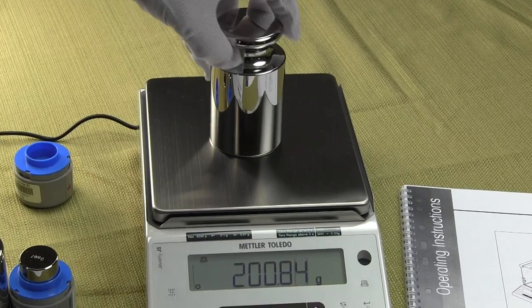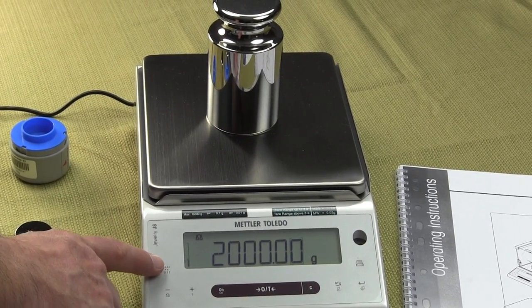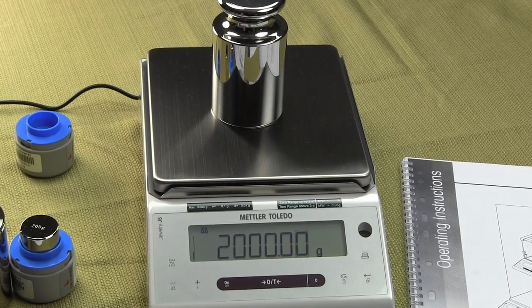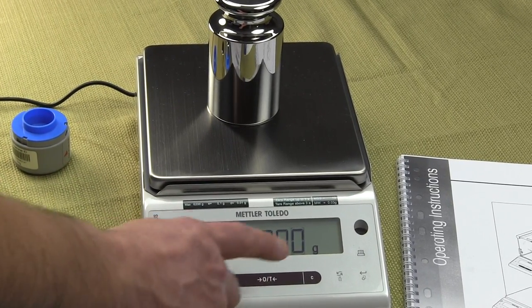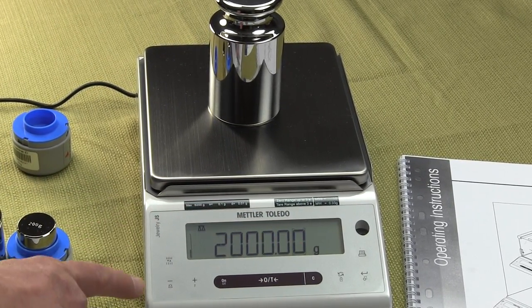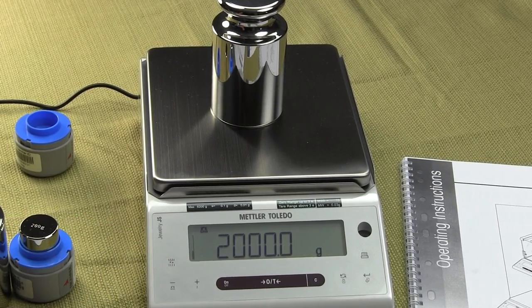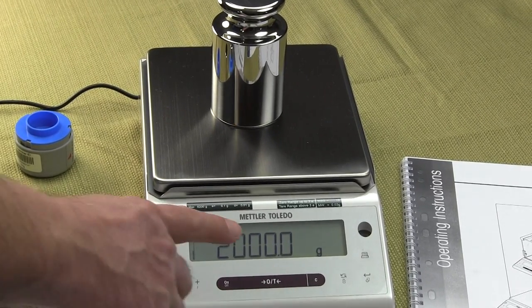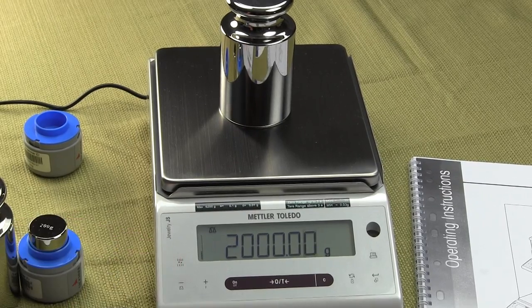Some of the features, you have a button here. This button will drop the readability by a factor of 10. So you see we have 2000.00. Some people, that last decimal place bothers them. So all one needs to do is press this button and now we lower the readability by a factor of 10. To put it back, simply press the button again.